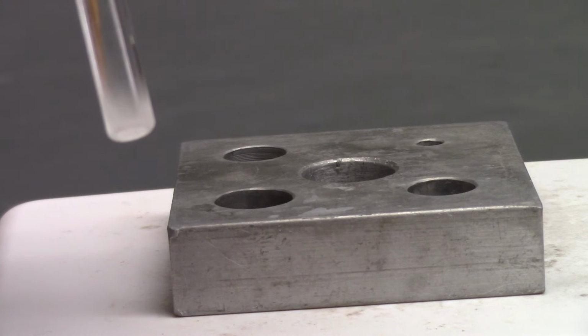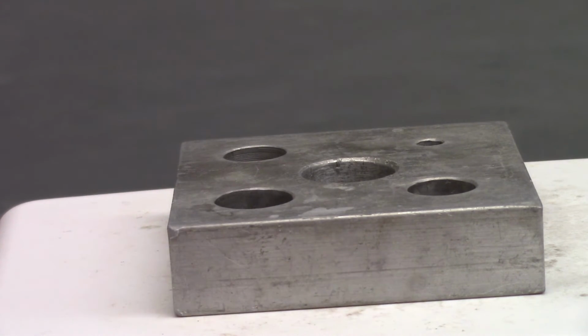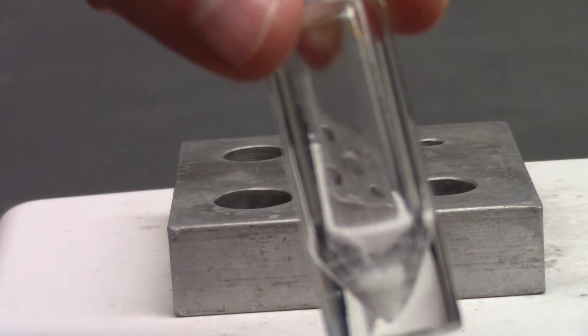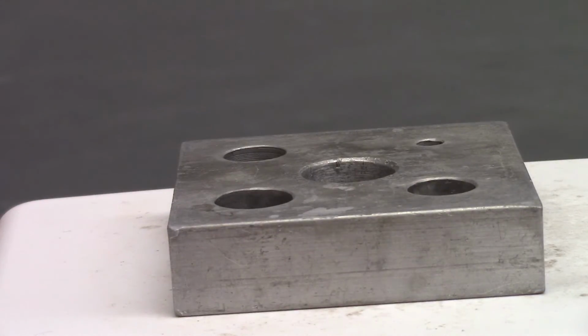I'll post more about that online for you guys. But that's how it's done. That's the sublimation purification. Now, down here, there's still some material left, and that's some of your impure stuff, some of the product you didn't want. So that's pretty neat. So there you go, guys.